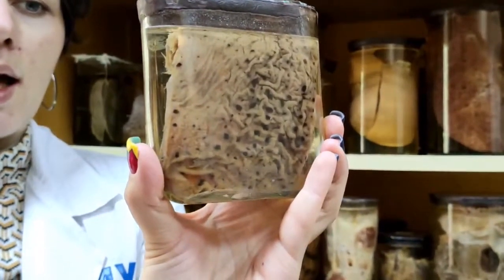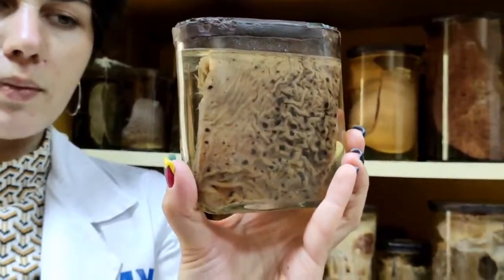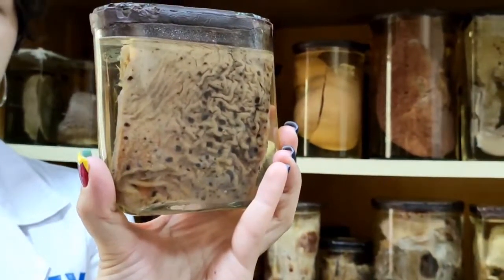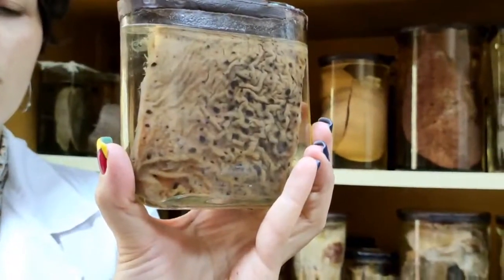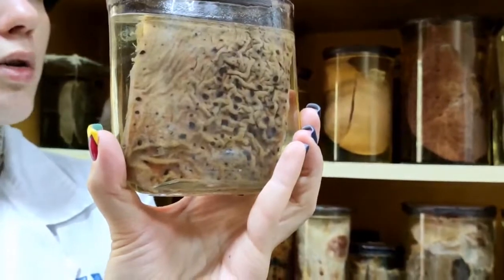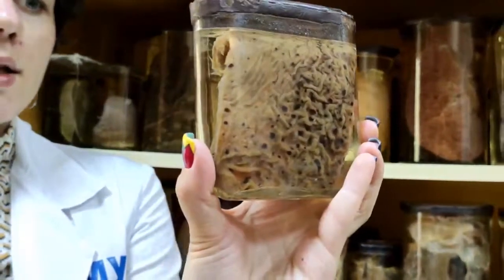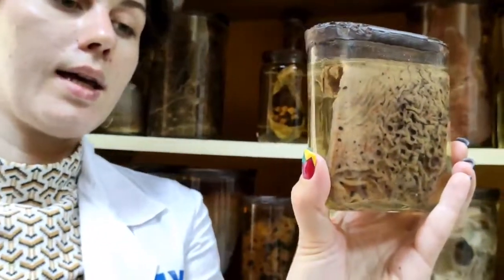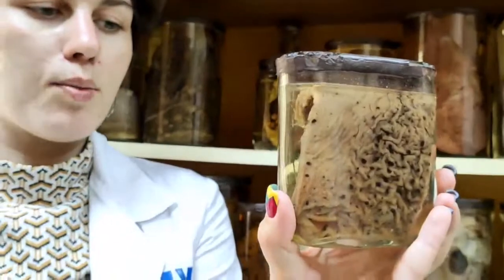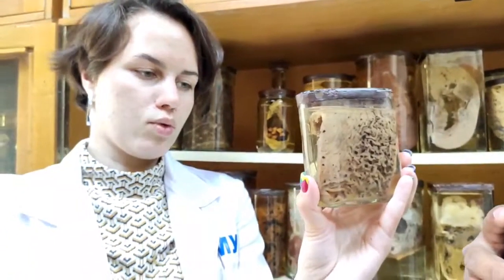Because when blood from erosions interacts with hydrochloric acid, we can see accumulation of a pigment called hydrochloric hematin. Hematin is of black color, and usually erosions heal quite well. When the patient is healthy, we don't see any marks of erosions in the future.